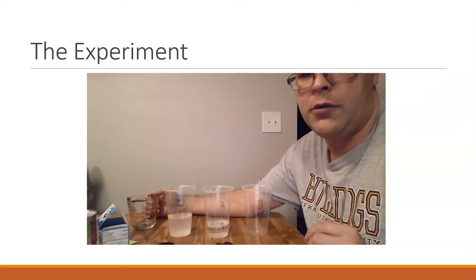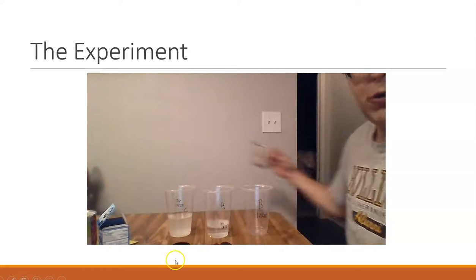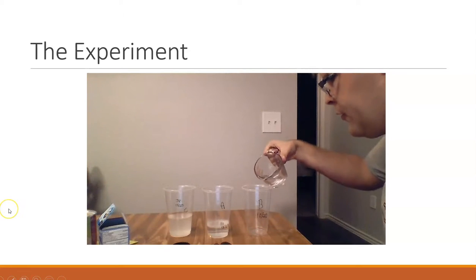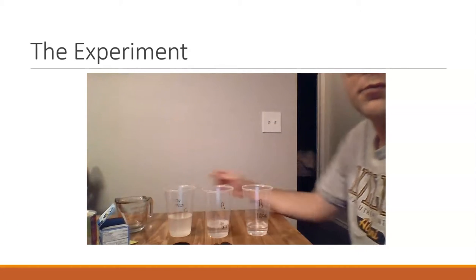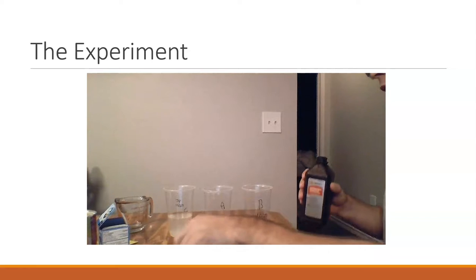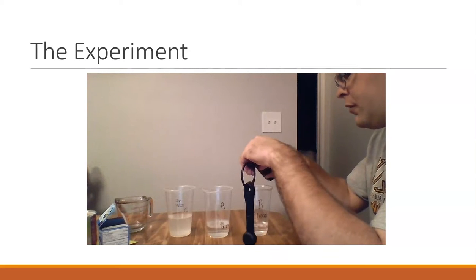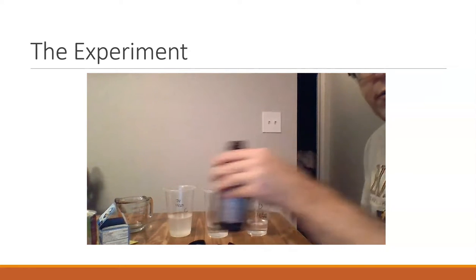Okay, now we're going to move on to solution B. Give me a moment. Peroxide. Spilled a little bit.